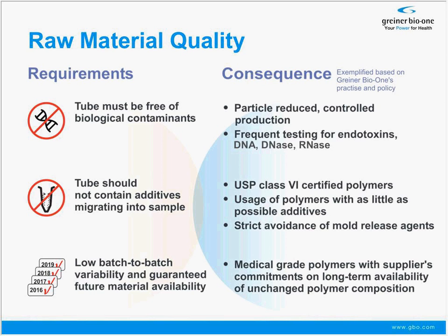And if we think back that raw materials can be discontinued or can be changed in their composition, this can become rather critical. A solution here is another kind of label that raw materials come with.